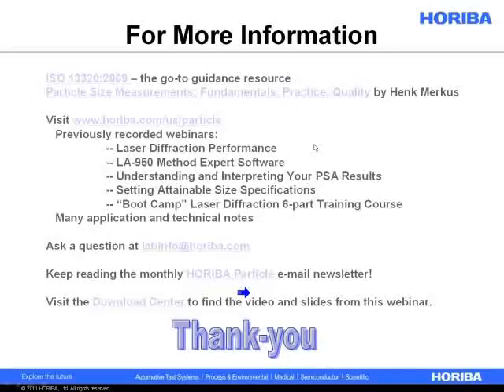Yes, if one component is absorbing light, it can affect the total particle size distribution. If it absorbs so much light that it is effectively invisible, then it won't appear on the particle size distribution. If you're measuring a material that doesn't absorb at all, mixed in with a material that absorbs quite a bit, then effectively it'll be like weighting the distribution towards the particle that does not absorb, because the analyzer is effectively seeing more of those particles, since more of the light interacting with them is being scattered to the detectors.